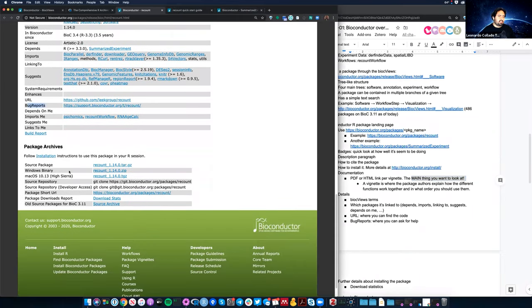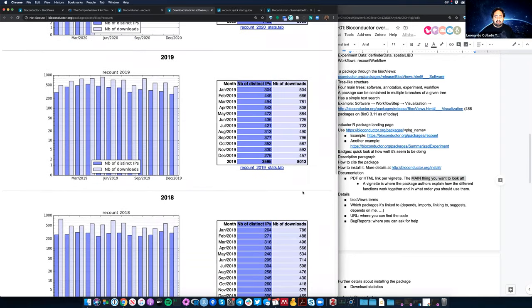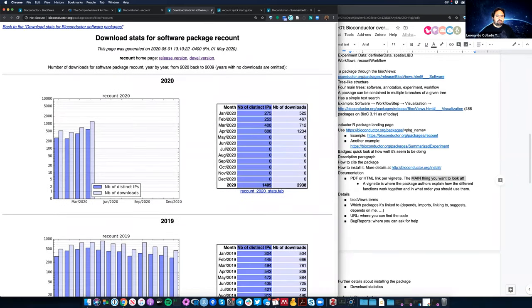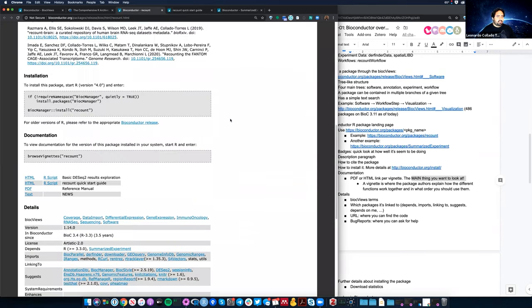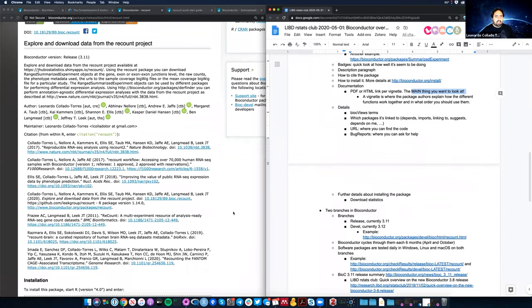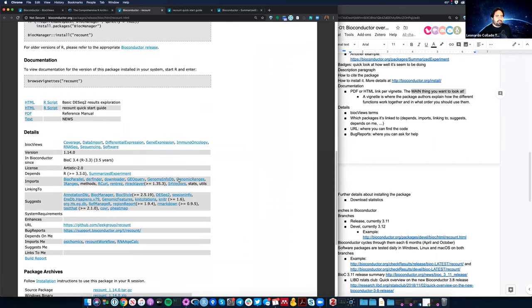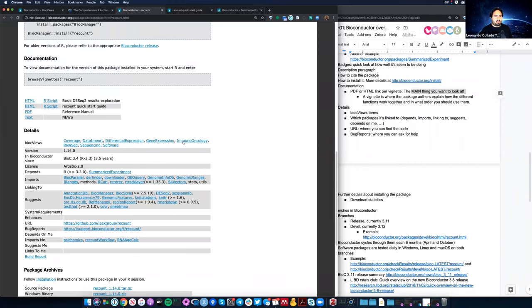If you go to package archives, there are more details, but the download statistics can be useful — for example, you get a report of how many people actually downloaded the package. Recount in 2019 had 8,000 downloads coming from 3,500 unique computers. So as you can see, there's a lot of information in each Bioconductor package landing page, a lot of it really useful — though it doesn't always explain clearly what each section is showing.